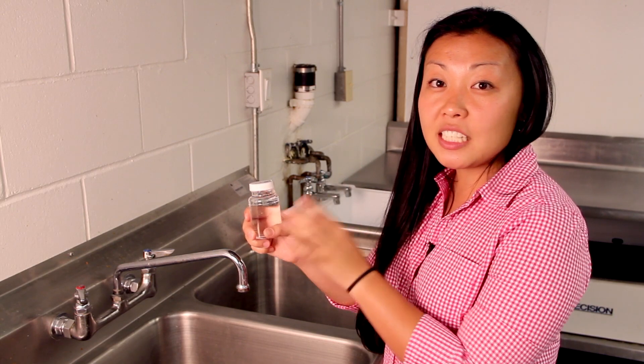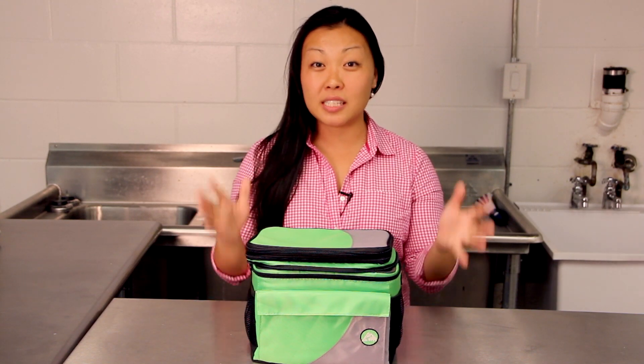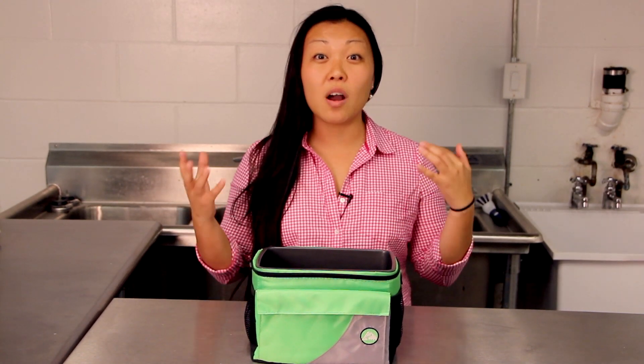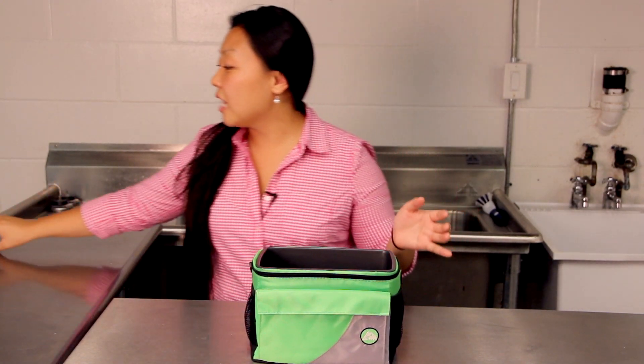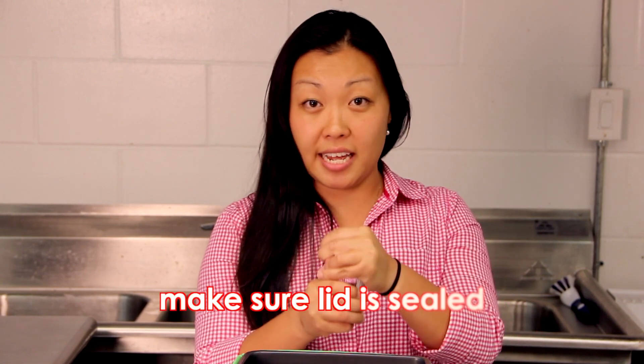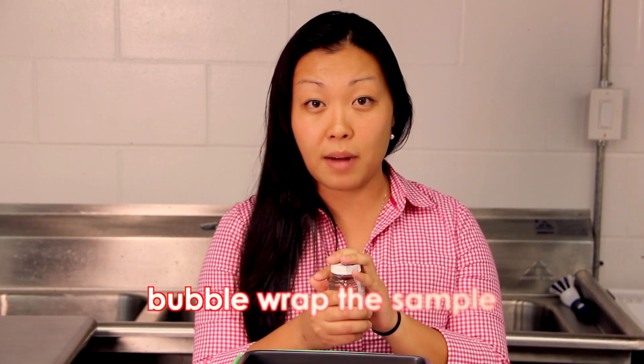The final step is shipping your water samples to us. After you've sampled your water, you're going to need to ship it. Take that same insulated cooler your kits came in and the freezy packs you froze overnight. The first layer is one of the freezy packs. Your second layer is your water sample — make sure the lid is tightly secured, put a piece of tape over it, and to be extra cautious, bubble wrap it.